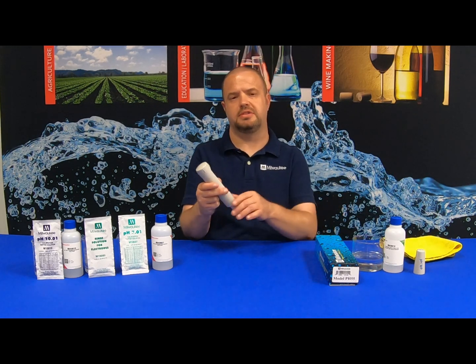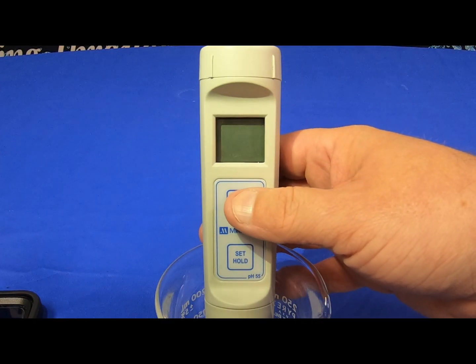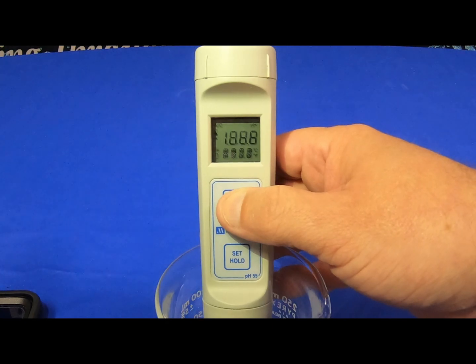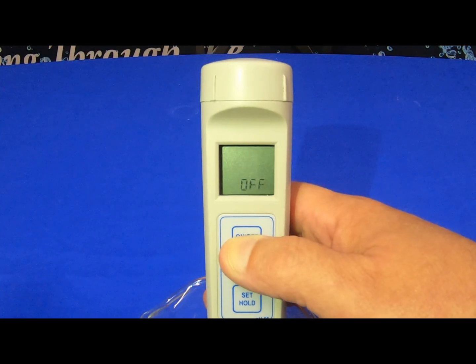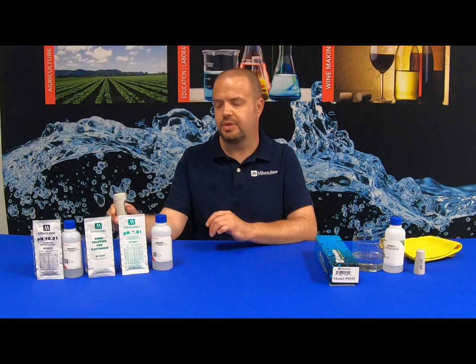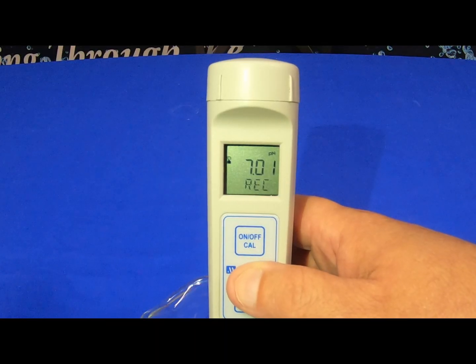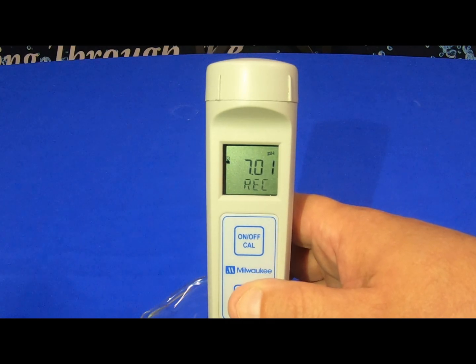We're going to start the calibration process by turning the unit on and letting the display screen pop up. Once the screen pops up, you're going to hold the on-off cal button until CAL displays. Then you release the button and it's going to say 7.01 USE, which is when you put it in your seven calibration solution. It takes a couple of seconds and then it will read OK-1, notifying you that the seven side of the unit is calibrated.